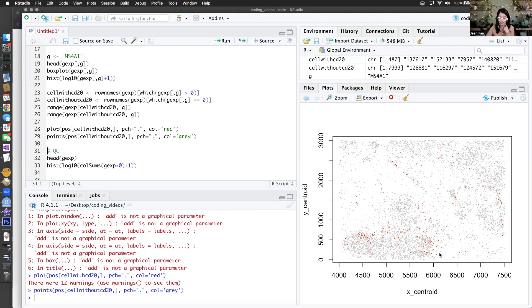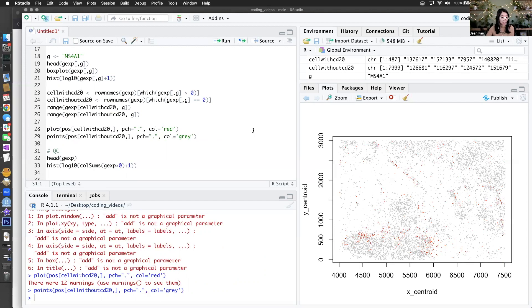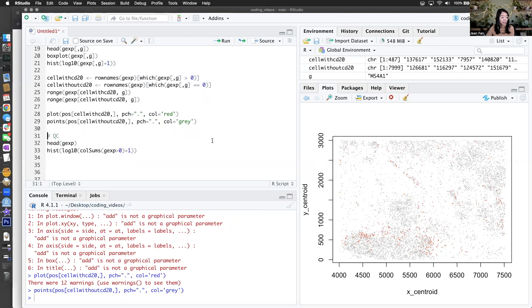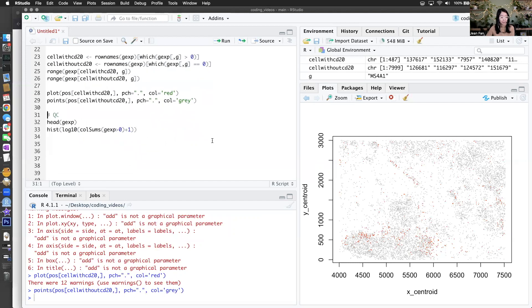Okay, that's interesting. Maybe CD20 marks B cells, as far as I'm aware. We might want to see what other cell types are co-localized — that could be a fun data visualization exploration. It looks like the results are sensible.